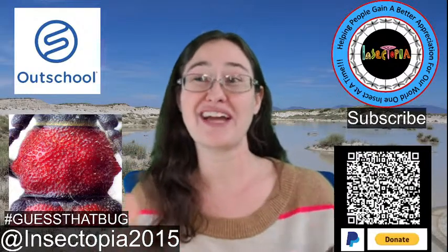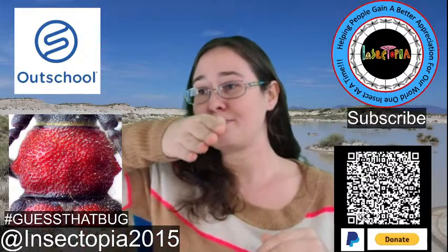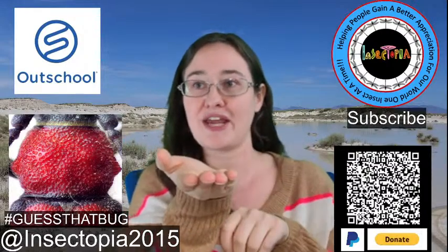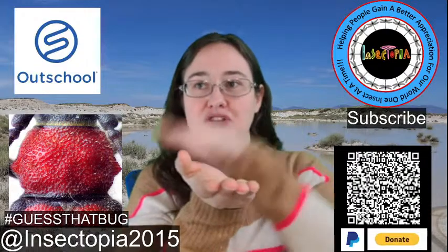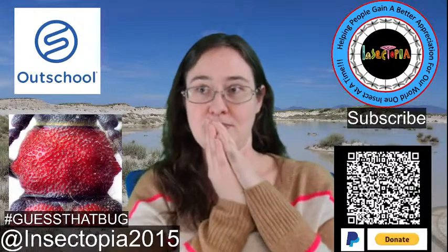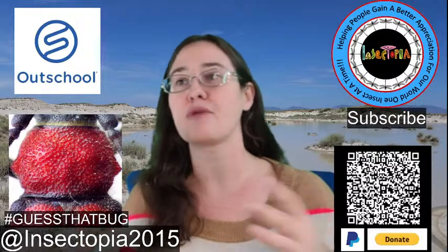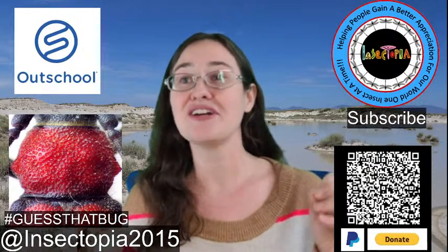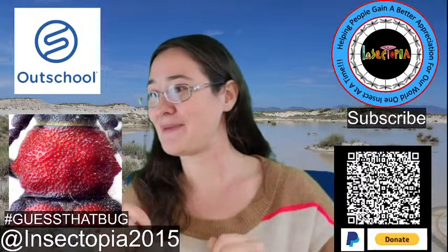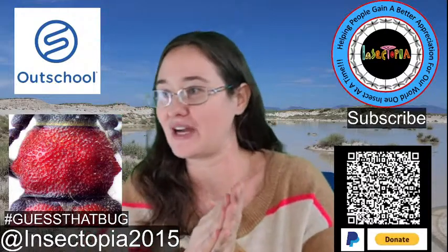So what you do is you collect the dragonfly alive, and then you turn them upside down so that their wings are along the bottom of the container, and then you put the microscope slides on either side, and you dispatch them in the acetone. And the acetone pulls their fat and the muscle out of their body so quickly that the color tends to stay. That's the best I got. It's a little tricky, but it's how people do it.